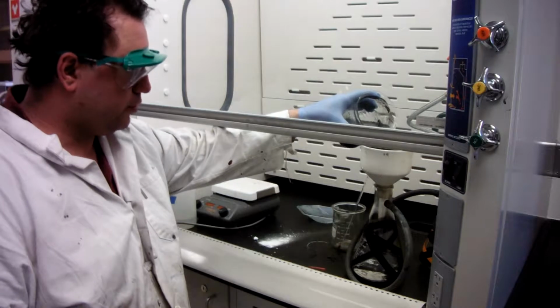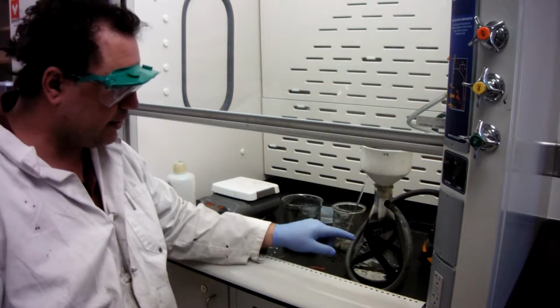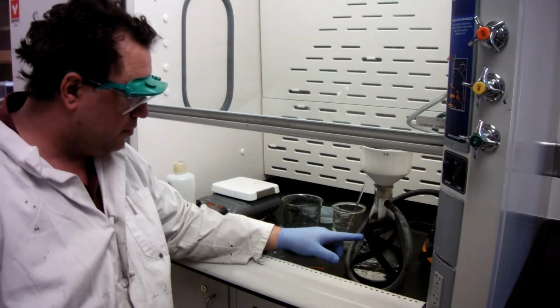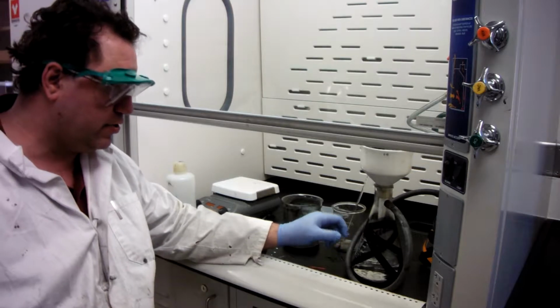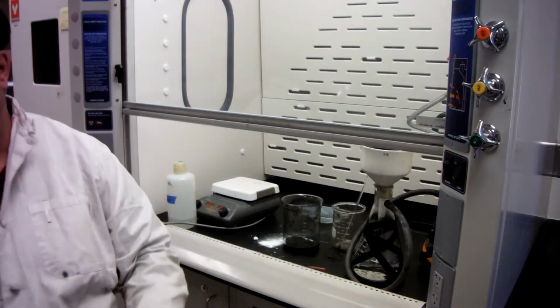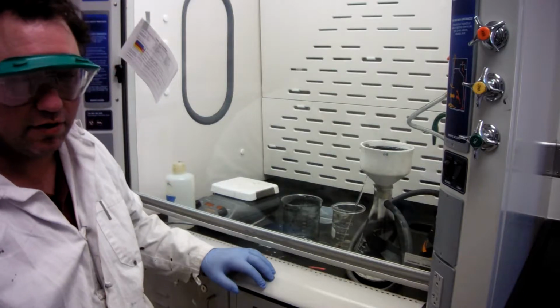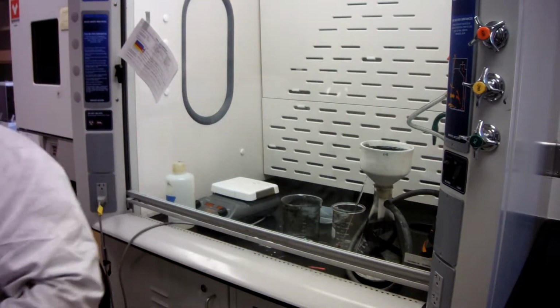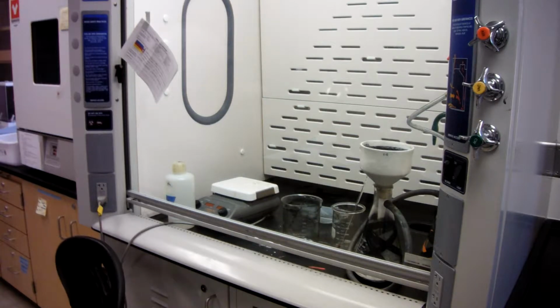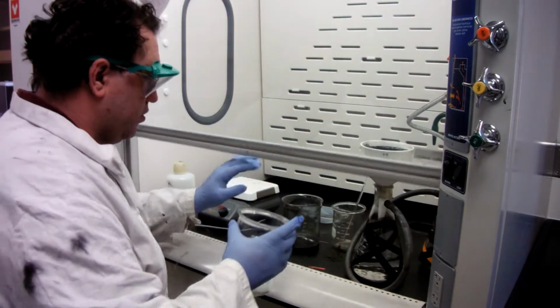As you pour it through, watch your filtration flask for fullness. When it gets to about 1,000 milliliters or the top end, we go ahead and grab another beaker, empty that into the beaker, and then empty that in the sink with lots of water running, or an appropriate waste container, depending on the waste procedures at Evergreen at the time of you seeing this video. So I'm going to show you how to do the transfer of waste.